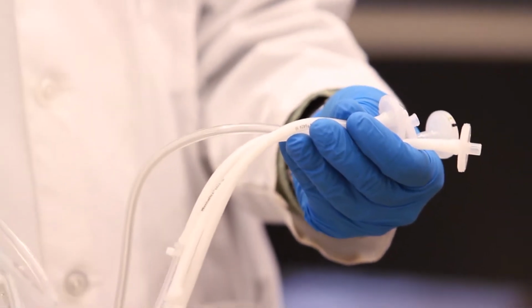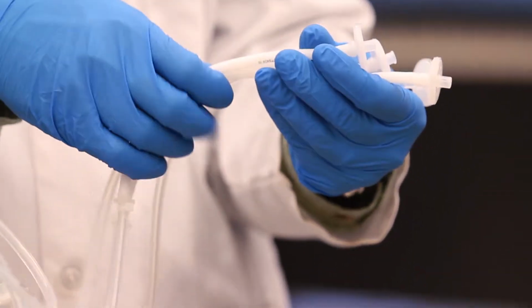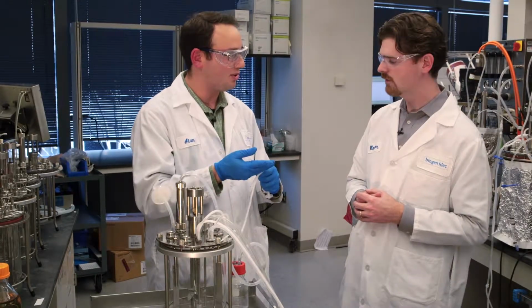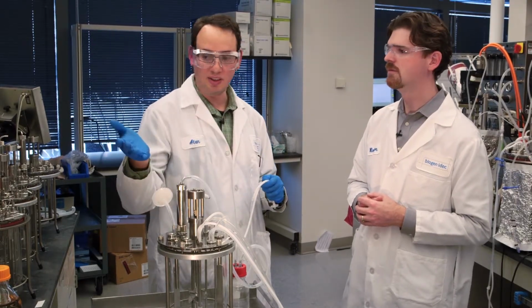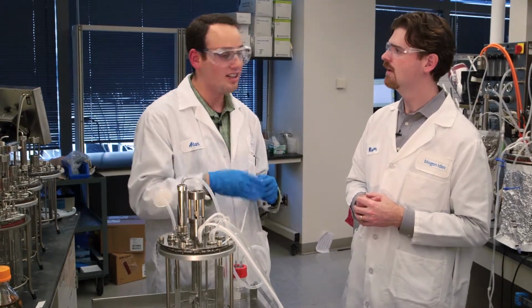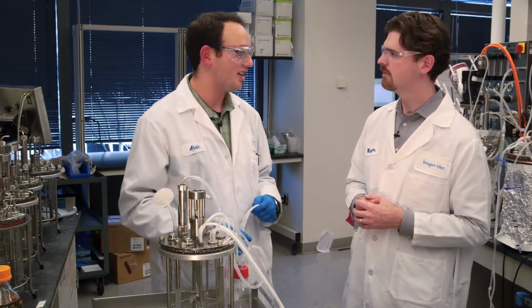We have both the clear and the white tubing, which is what we call weldable. I can walk up to a bottle that also has weldable tubing, heat them up, seal them together, and then I can sterilely deliver nutrients, base, things like that, to my cells without worrying about contaminating the reactor. So you can splice things directly on the fly.